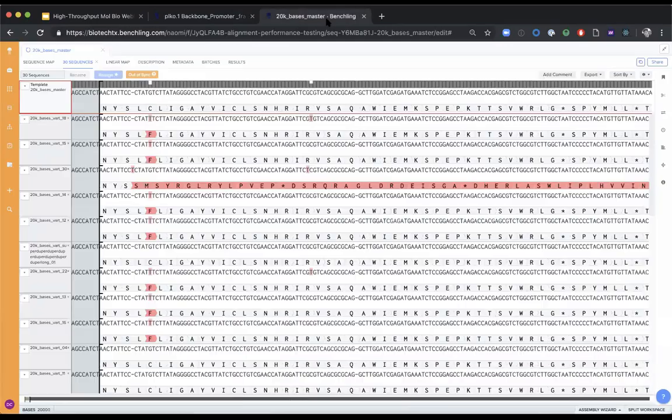And so you can imagine doing this for a much larger alignment, something that might look like this, where you're aligning 30, 40, 50, 60 sequences in one alignment. This allows you a more global view of the samples that you prepped on the bench compared to the ones that you've designed in Benchling.